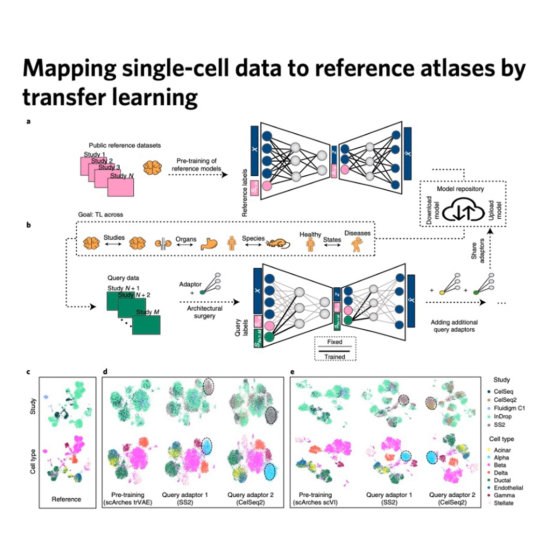Exactly. So the workflow is this. You build your reference atlas using rich CITE-seq data that has both RNA and protein. Then you take an older, cheaper RNA-only dataset as your query. And you map the RNA-only data onto the multimodal reference. Yes. And because that reference map, that latent space, understands the relationship between RNA and protein, the model can actually impute the missing protein levels for your query cells. So you can predict what the protein expression would have been on cells where you only measured RNA. You can. You can predict levels of key proteins like CD3 or CD14, effectively adding a whole new layer of data to older experiments, which is just transformative.